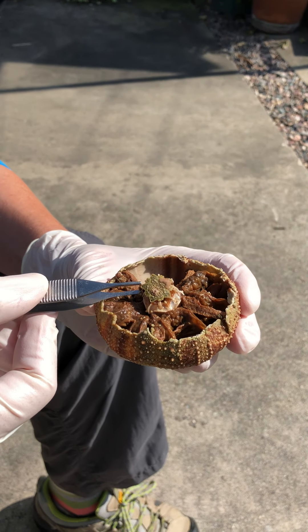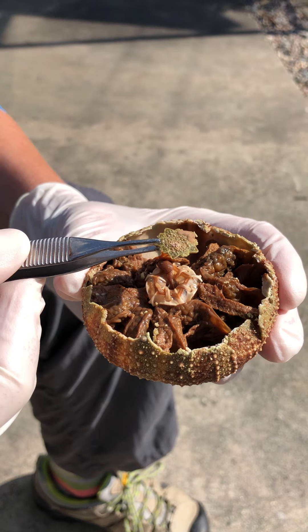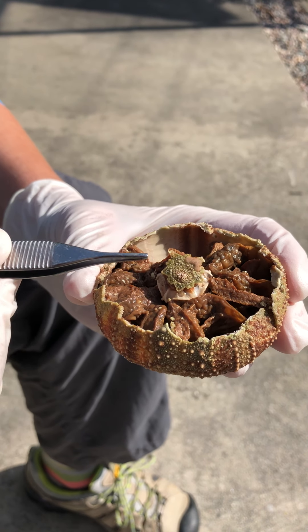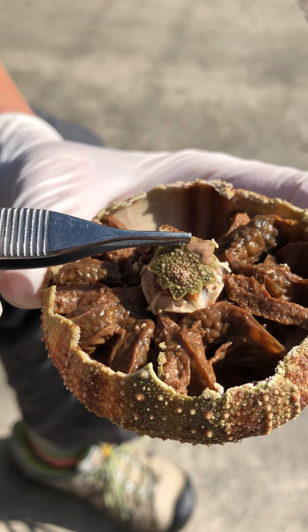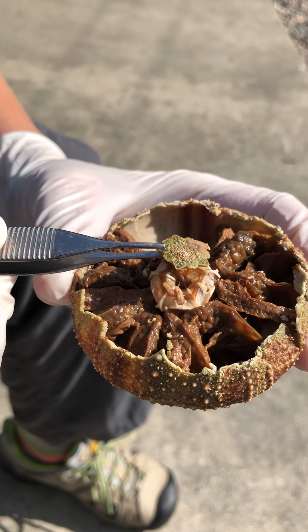The only part of the aboral end that is still intact was sitting right at the midpoint, right about here. We have the anus, the periproct, and the madriporite. Those are still there.